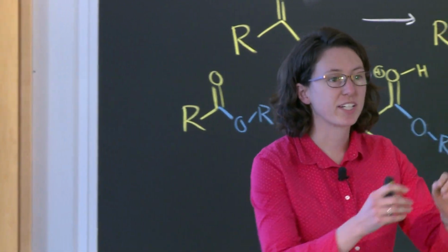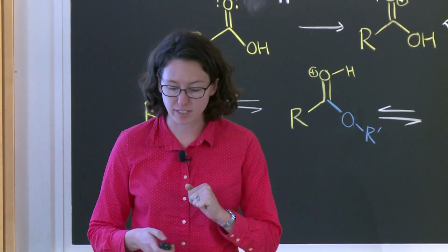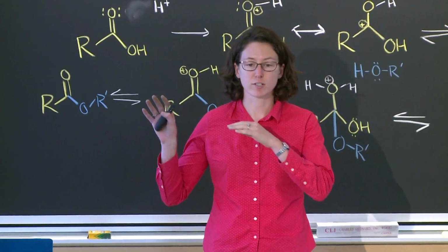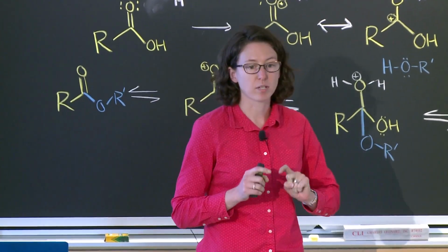All right, good afternoon. We're going to get started because we have a lot to talk about for this one lab before a lot of you get to do it starting next week. So we are done for now talking about the essential oil lab, and you'll get one more lecture about that and the X-ray crystallography stuff coming up next week. And for now, we're going to switch gears and talk about the Ester lab.